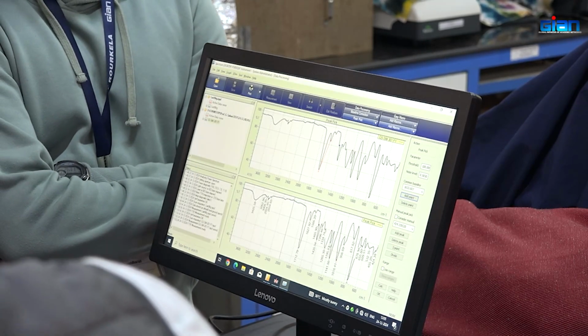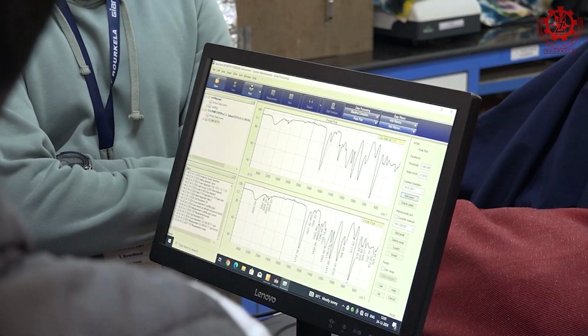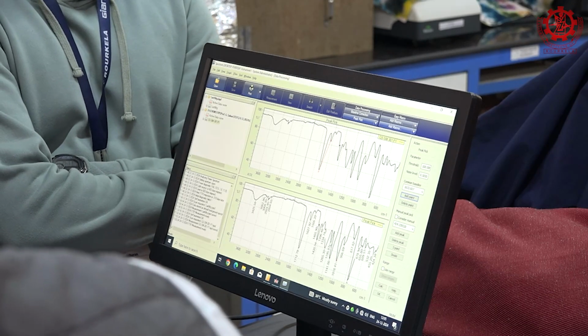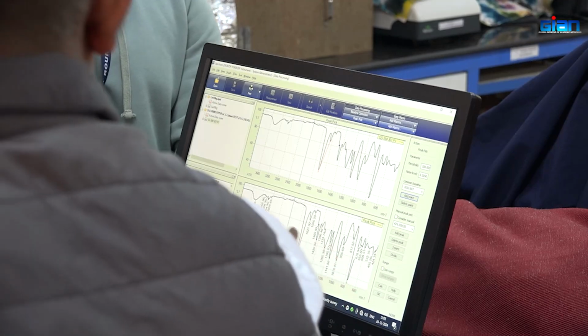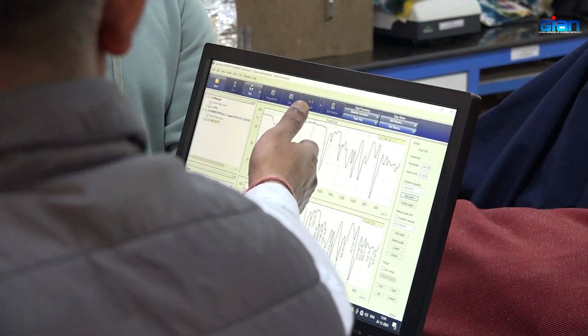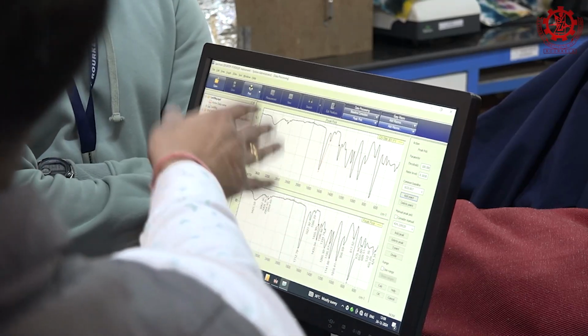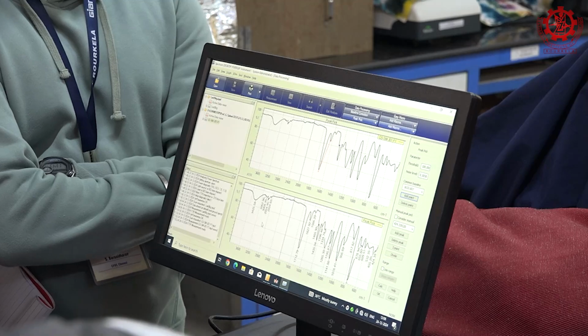So, they all come after 1400. Okay. So, you study that one and it is mostly informative that we get all data from that region. Now once you get this, of course, it is easy to export this, you can show that one. So, we get our IR spectrum of the compound given there.